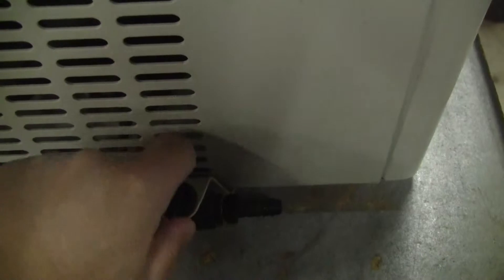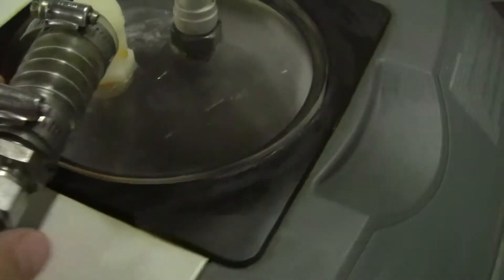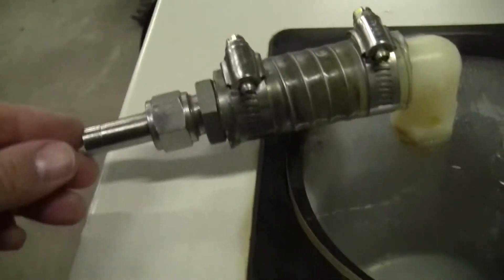You have your drain over here. Nozzle. On and off. Connection in.